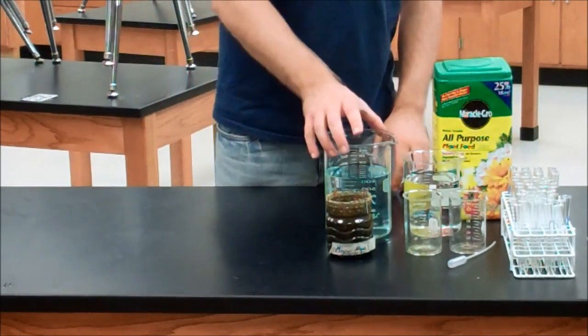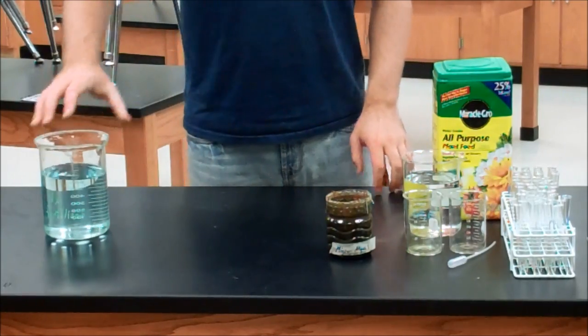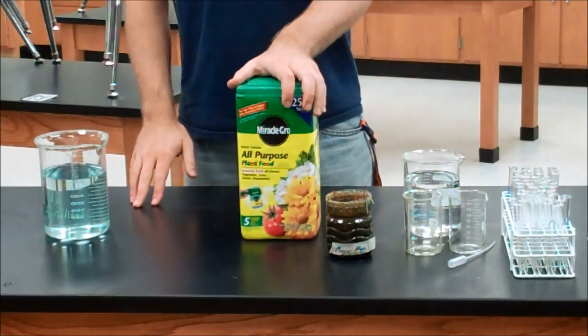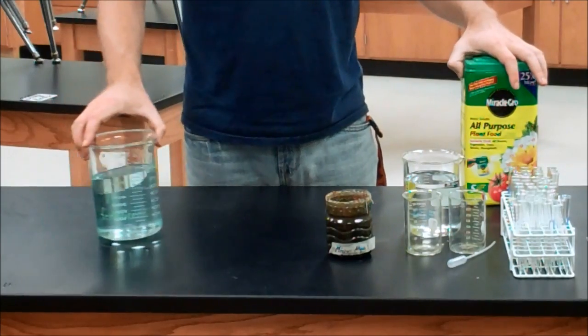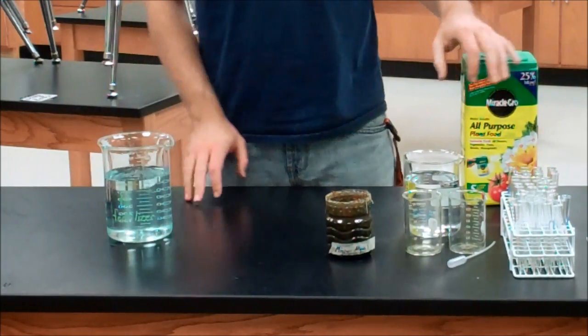The first thing we're going to need to do is mix up some fertilizer. Use the concentration recommended on the can when you get it. Once you have it mixed up, make sure to label it. That's your 1X fertilizer.